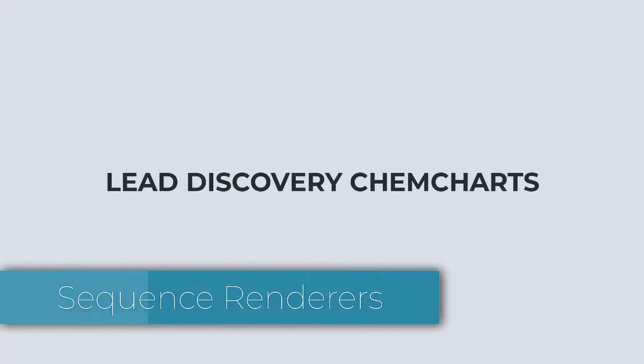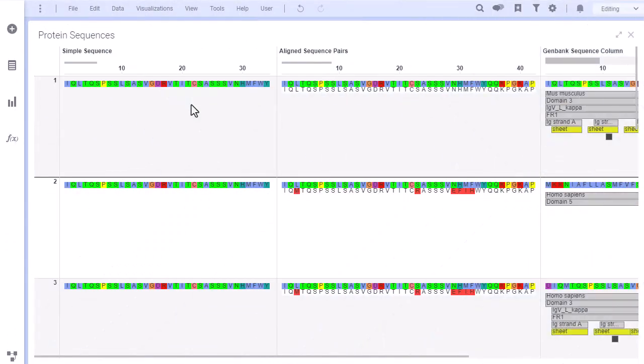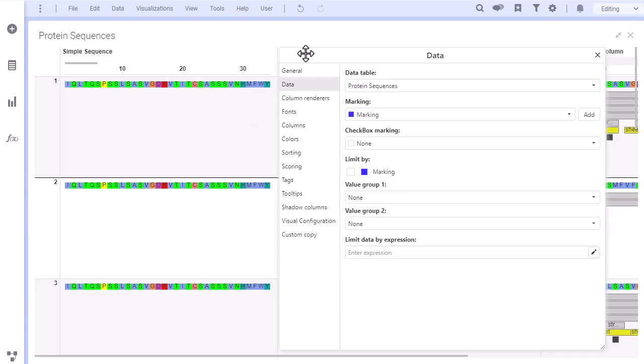This tutorial will describe how to work with sequence rendering in Lead Discovery ChemCharts. To access sequence rendering options, right-click inside a ChemCharts table and click on the Property Dialog icon. From the Property Dialog, table characteristics from colors and fonts to column headings and sorting can be adjusted.